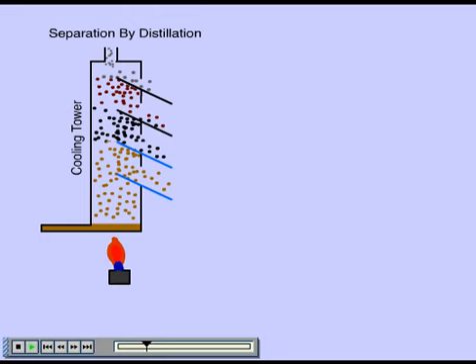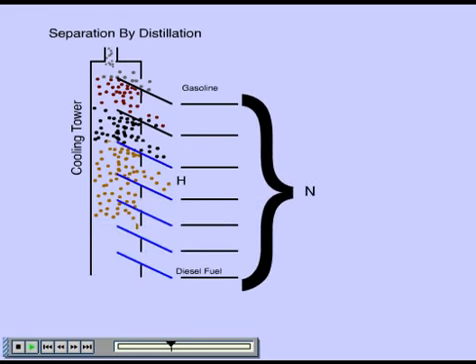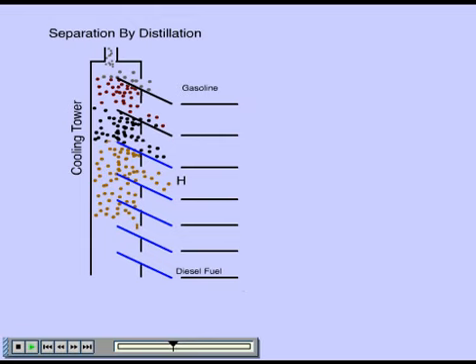of the cooling column. The more volatile compounds rise higher in the column, finally cool, and are collected by the higher plates. The concept of the plate was developed in order to judge the quality of the cooling column and the point at which a given class of compounds is collected. For example, how many plates are required to separate diesel fuel from gasoline? This concept, although slightly dated, is used to estimate the quality of all chromatography columns.